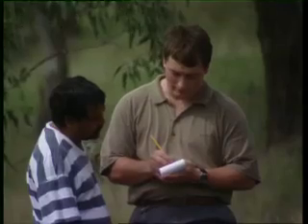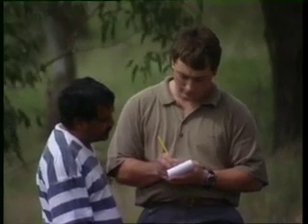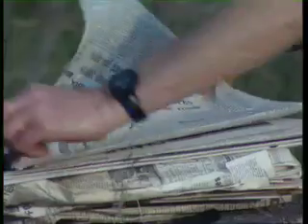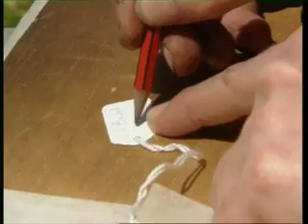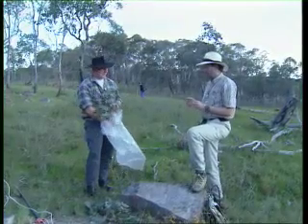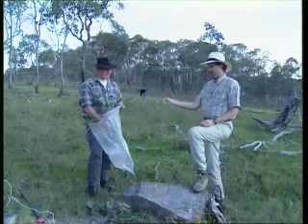Use initials and full last name. The collector's number starts from one for your first collection and continues in series. With more than one collector, the numbering is that of the first person. Record this name and number on the label and attach it directly to the specimen. Add the names of the others in the collecting book. Now you have a definite link between the information in the collecting book and the tagged specimen. Also tag any fragments and other material gathered.